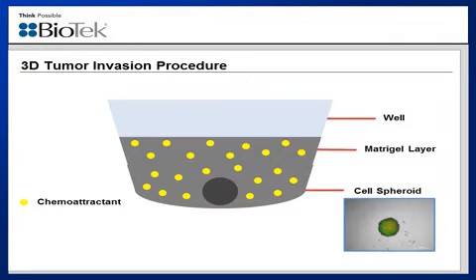Centrifugation in a cooled centrifuge then repositions the tumoroid in the center of the well and initiates the mixing of the two layers. And again, the same procedure is followed in the case of running an inhibitor experiment, with the difference being that an inhibitor is also added along with the chemoattractant to the aqueous and Matrigel matrix layers. Image-based tracking of tumor invasion is then performed for either type of experiment on a daily basis.